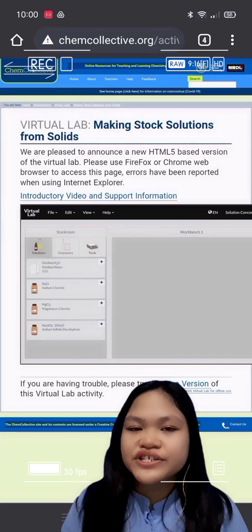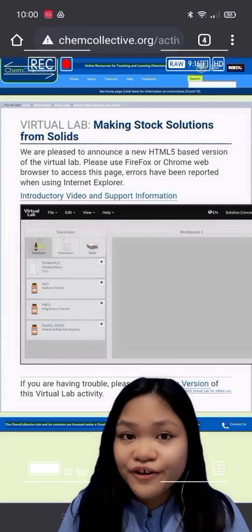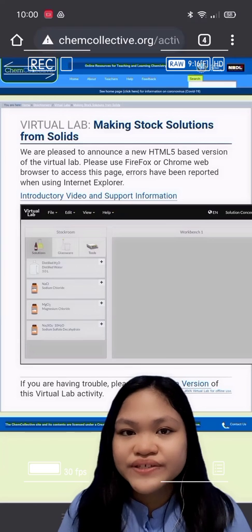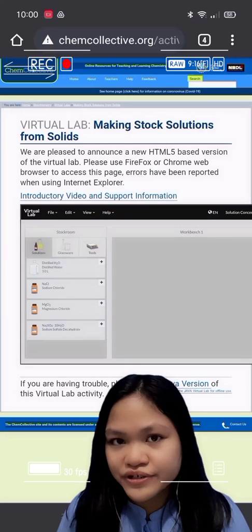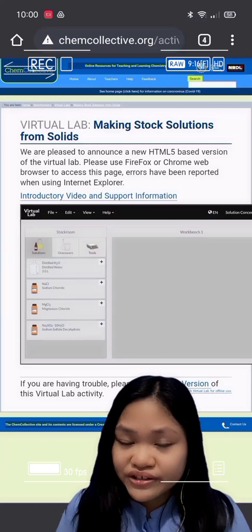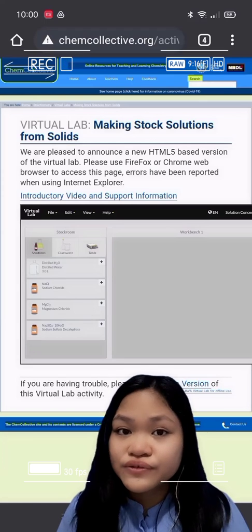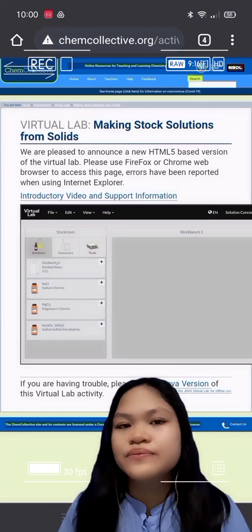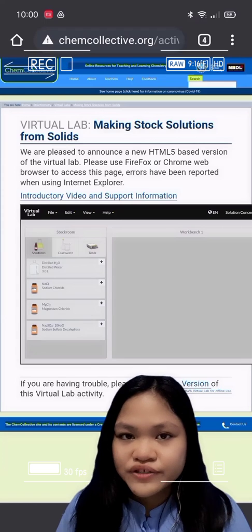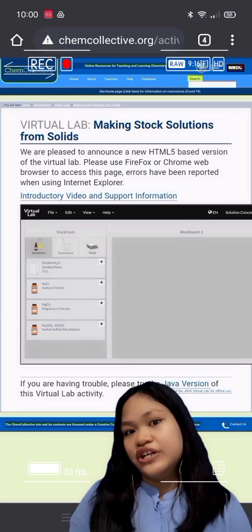Good day everyone. I am Rachel Solid, a first-year BS Psychology student, and I am one of the students of Mrs. Alfa in Chemistry. Today I'll be demonstrating how to do the virtual lab in making stock solutions from solid — more specifically the topic of Stoichiometry and Limiting Reagents of a Jell-O Problem.